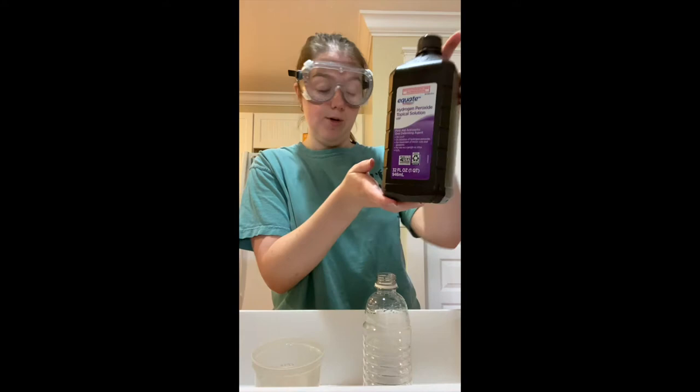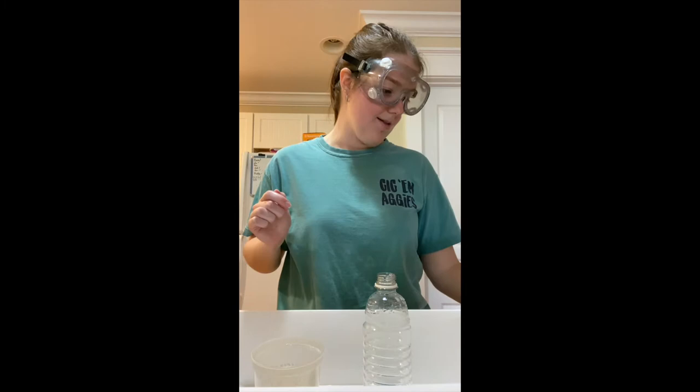Howdy, my name is Emma Slater and I will be demonstrating the effects of a catalyst on a reaction. In this experiment, I'm going to be using 3% H2O2 and rapid yeast. This will be my catalyst.